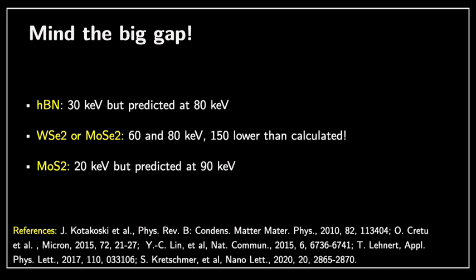And I just like to be clear, just to summarize, experimentally sputtering happens much sooner than this classical collision model would predict. For those who are really interested in this topic, I invite you to look at the references that I have on the slides. These references are really relevant to understanding this sputtering rate.